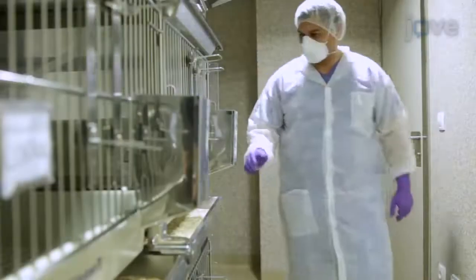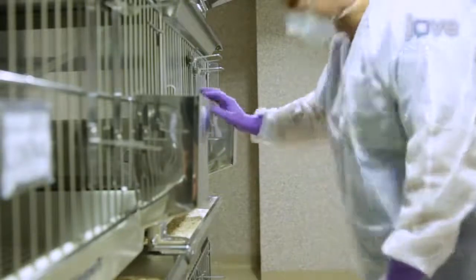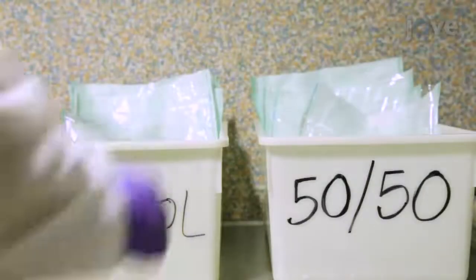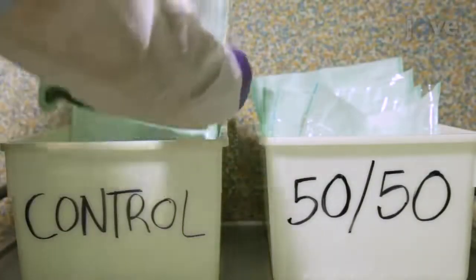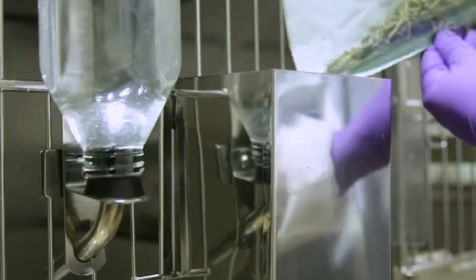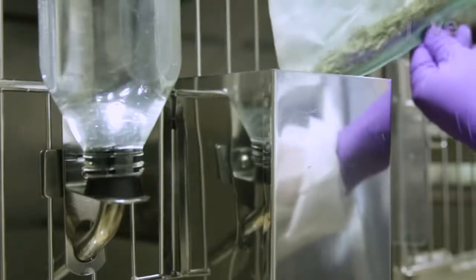To acclimate the animals to their diet, feed each animal in the control group 120 grams of control diet daily for four weeks and provide water ad libitum.